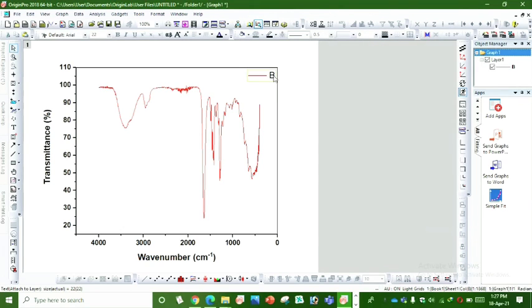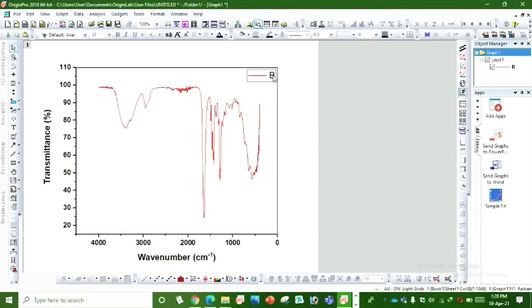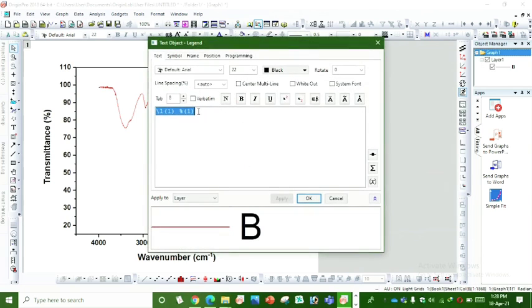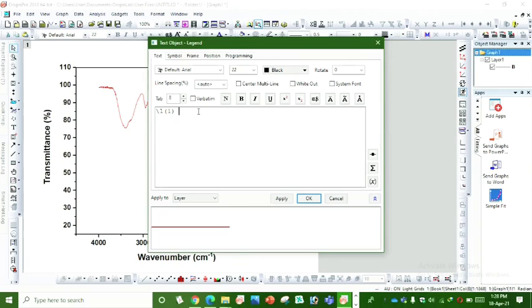You can change the name and write it as your sample name. As my sample name is PVP polyvinylpyrrolidone.